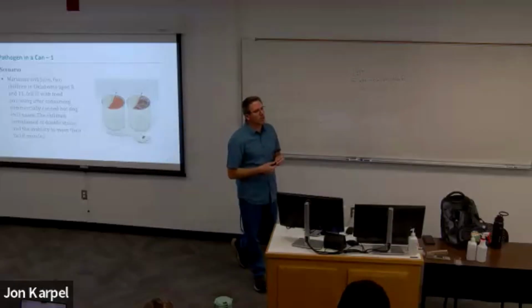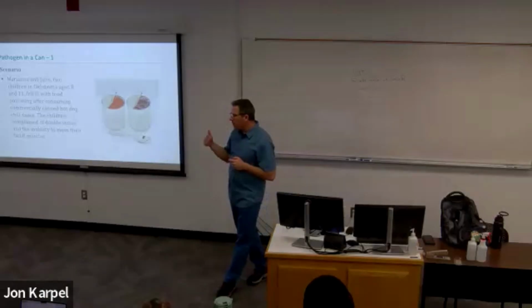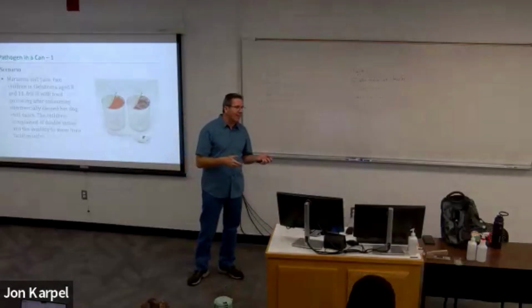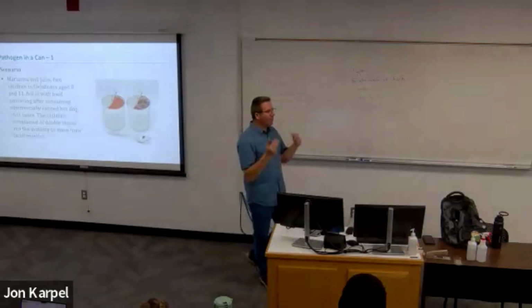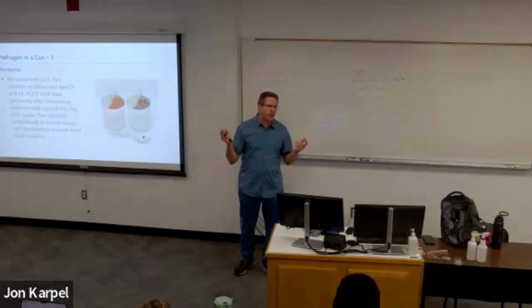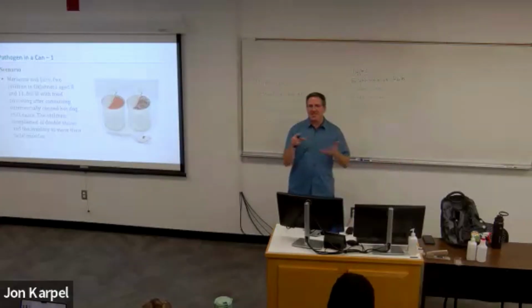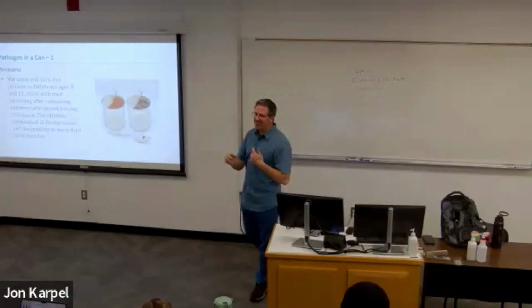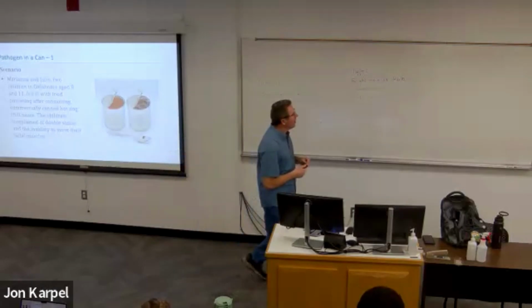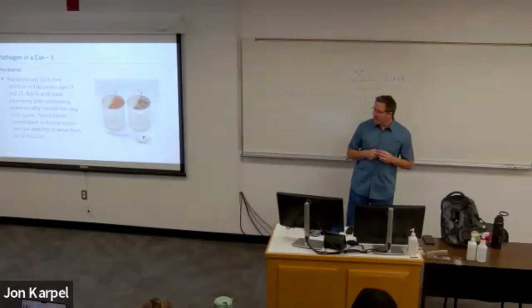But there are some interesting things we can learn, and some of these things will help you when you start using microscopes in lab. They'll help you use them correctly and hopefully avoid issues where I see students focusing in on a piece of fuzz or dust or something like that. You can figure out that you're not seeing what you're supposed to be seeing, and so you can adjust things for yourself. So that's why I included a microscopy lecture in the slides.